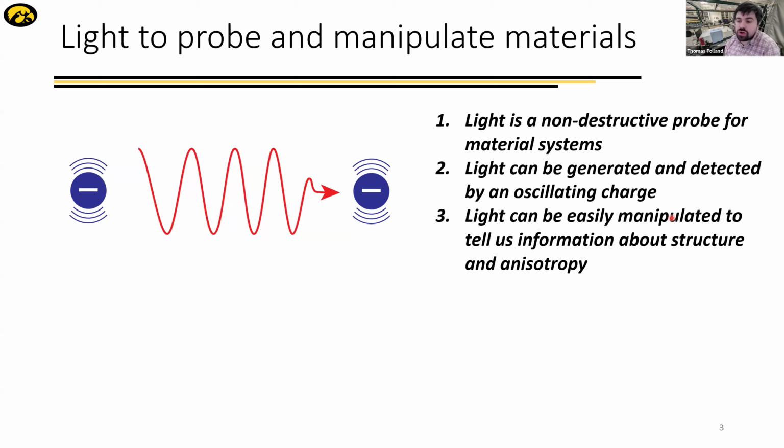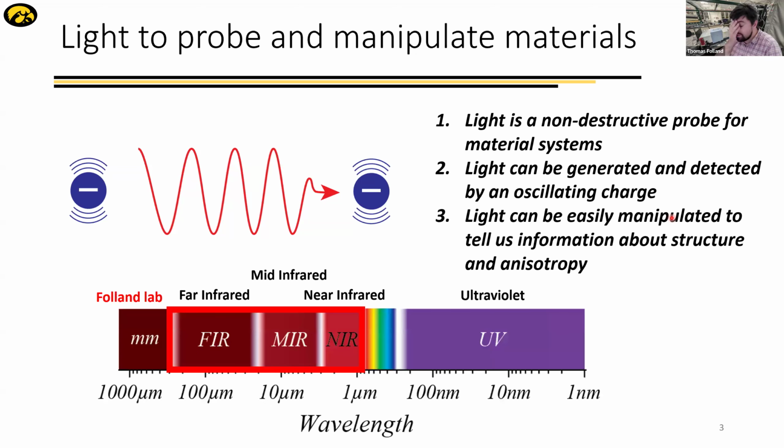And so, in my group, again, there's a whole spectral range. People study the photonics of van-der-Waals materials at all wavelengths, but I particularly focus on the infrared, which is a wavelength range really longer than 1 micron. So not visible light, but going from 1 micron out to very long wavelengths, even into the terahertz.